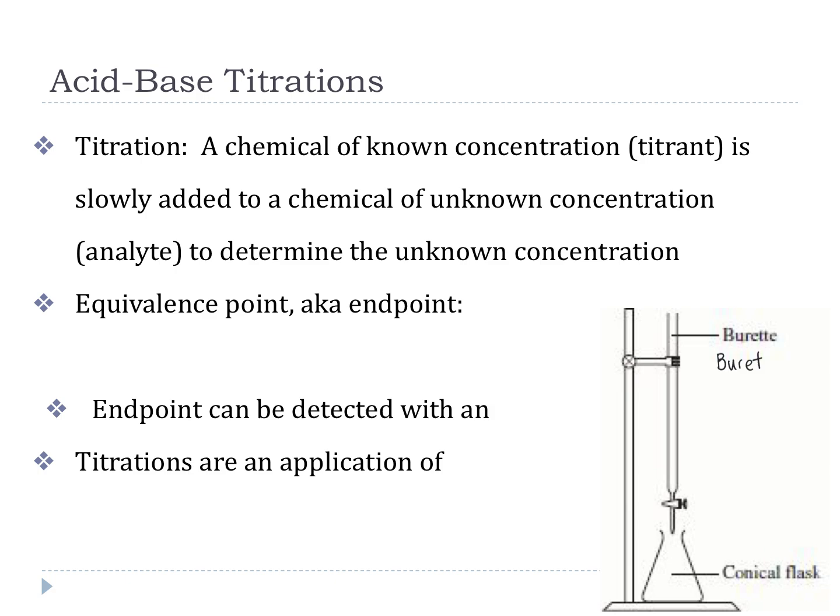In our titration that we are going to be doing in the lab, our titrant is going to be sodium hydroxide. So we always put the titrant in the burette, and in our case, we're going to have sodium hydroxide in one of our burettes.